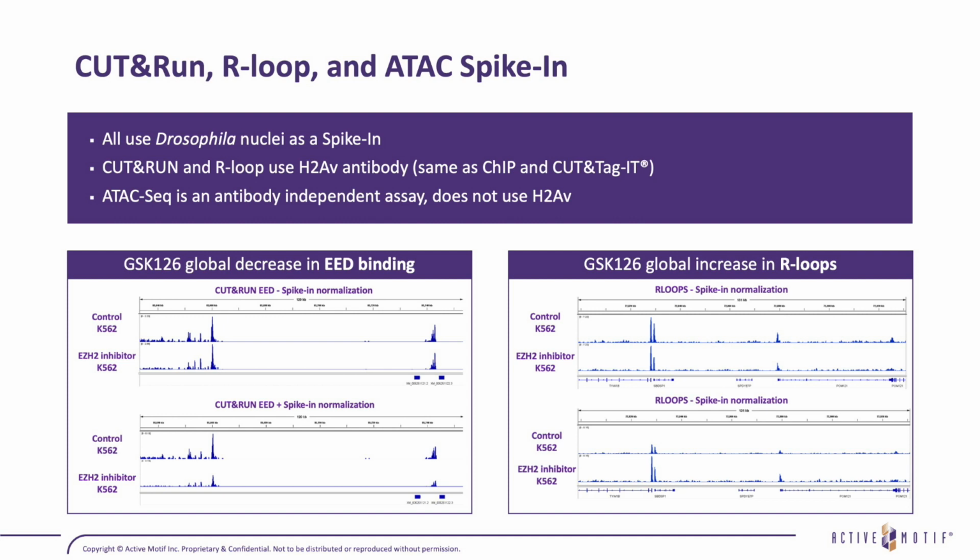First of all, you have an RNA-DNA hybrid, and that's in conjunction with a single-stranded DNA piece. These structures in the genome regulate gene expression. It just so happens that there's an antibody available against DNA-RNA hybrids. It's called the S9.6 antibody. So we can use this antibody to direct CUT&Tag to R loops and get an R loop profile.